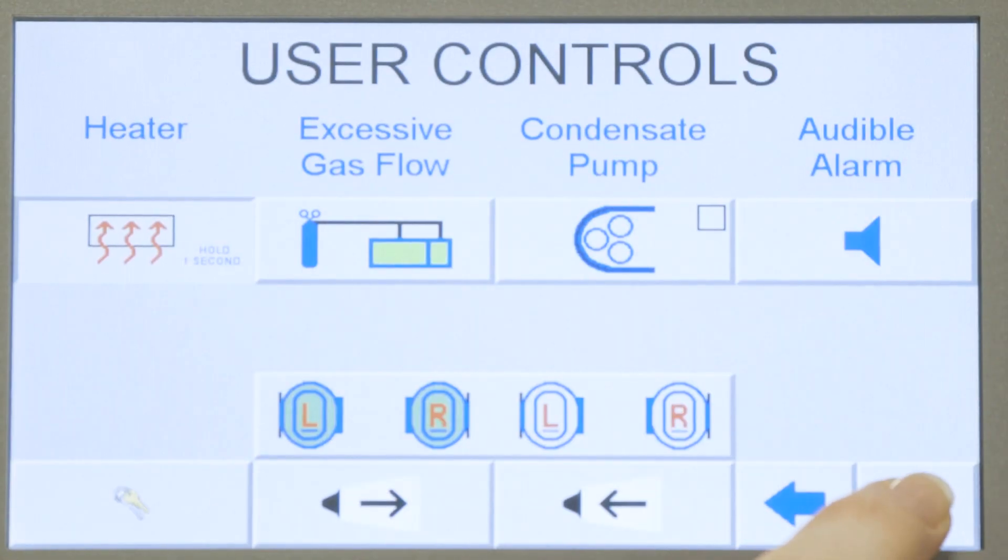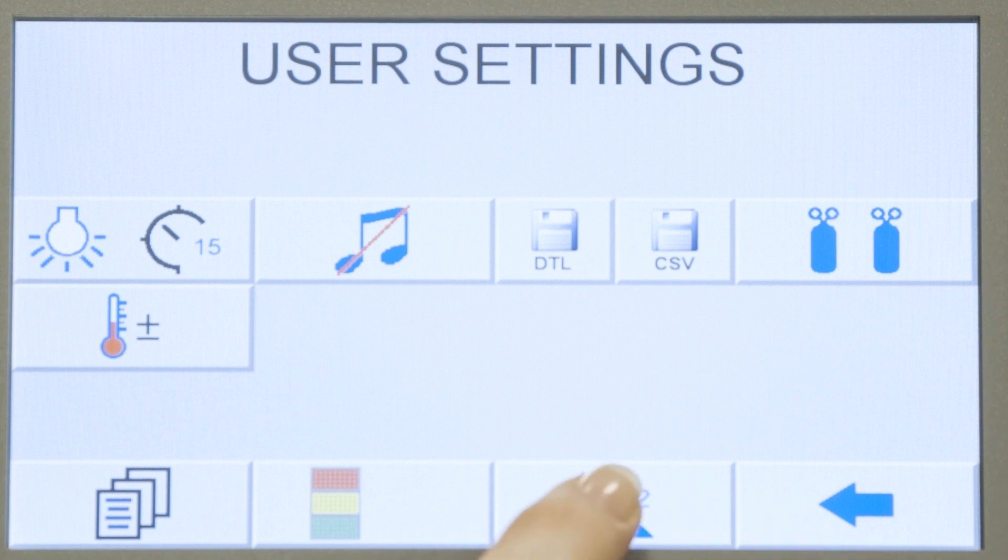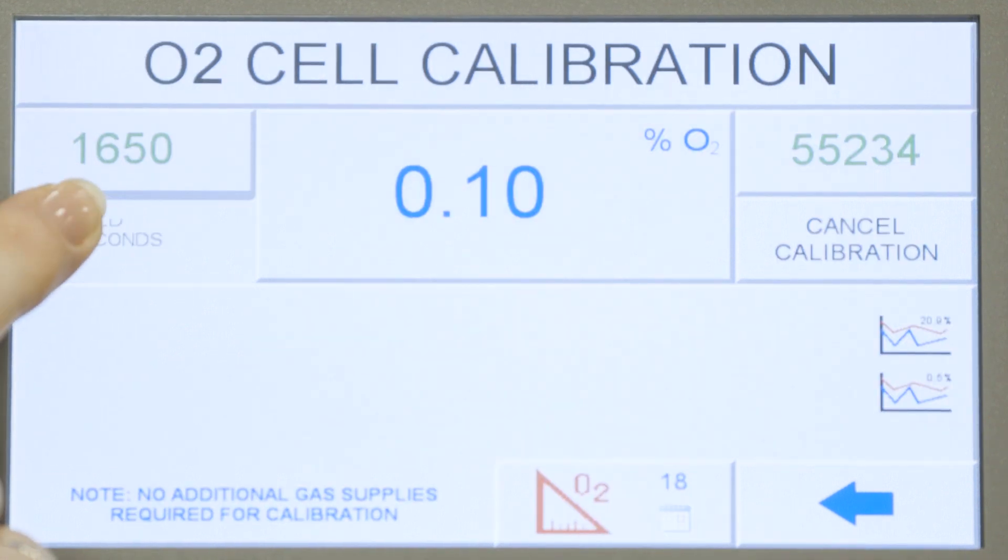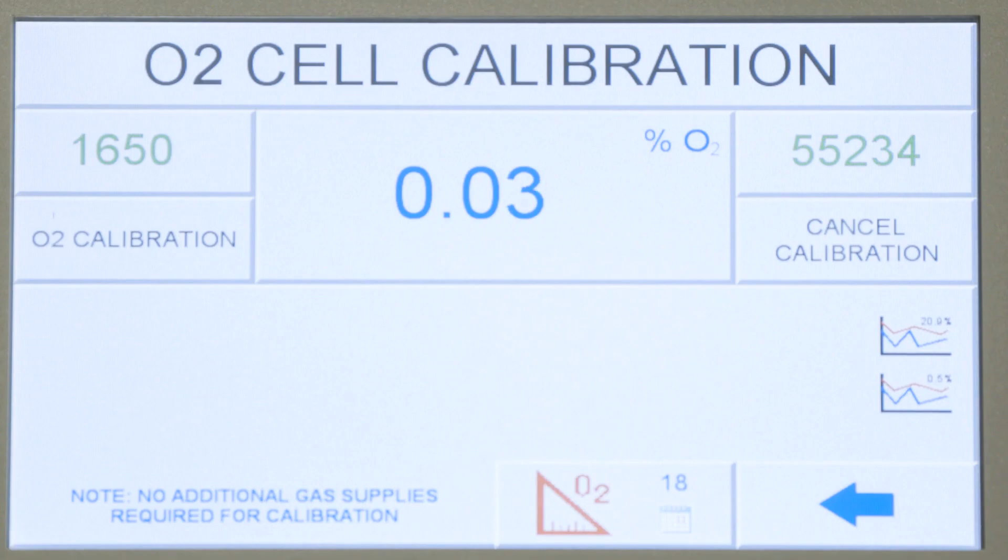Our patented fully automated oxygen calibration routine is activated via the touch screen, with no need to touch or remove the sensor. This saves time, reduces the risk of user error and provides confidence in the accuracy of results.